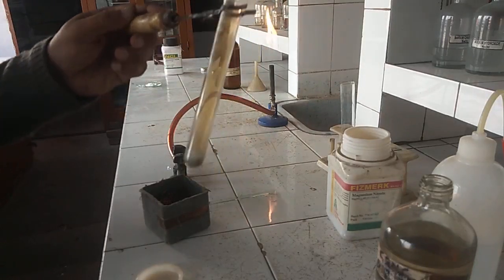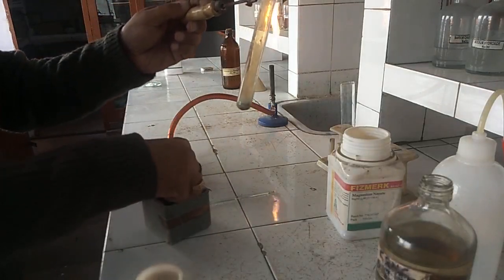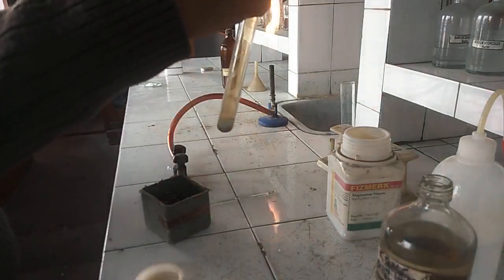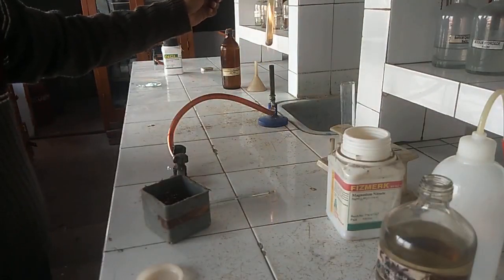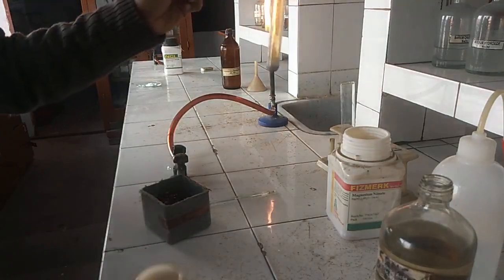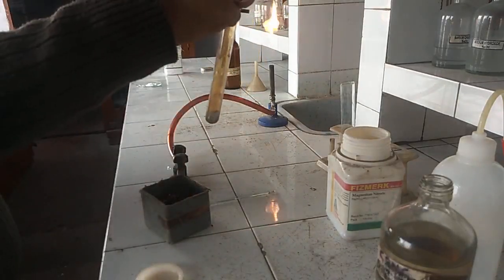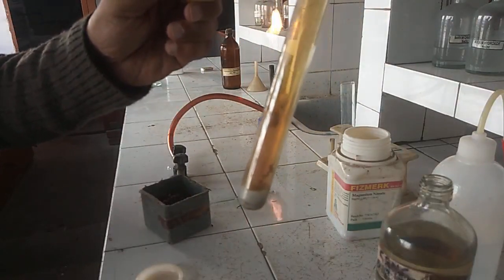Now we will add copper turnings to this. Addition of copper turnings will intensify the formation of brownish vapors in the test tube. We will add copper turnings. Copper turnings are basically ribbons of copper metal, and again we will heat the reaction mixture. The brownish gas will get intensified on adding copper turnings.